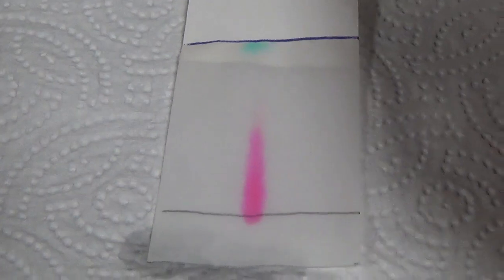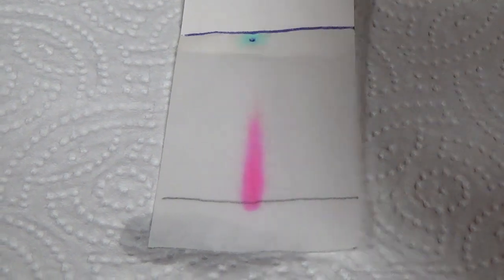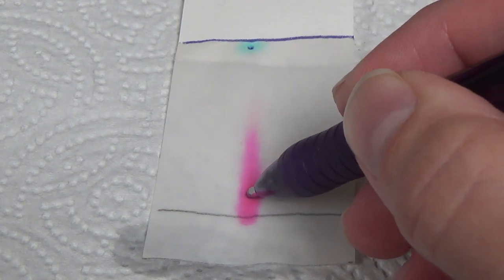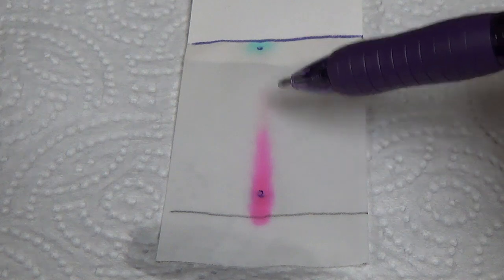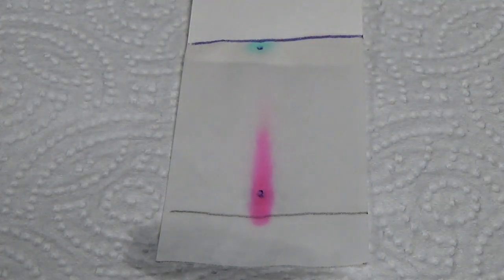And then I also want to find the center of the color blob. So there's the center of my blue blob. And finding the center of my red blob, I feel it's kind of right there. Okay. Now, if we waited longer, more and more of this red is going to be moving up and up and up. And so it would continue to separate them the longer we give them. But this is certainly plenty for our qualitative work right here.